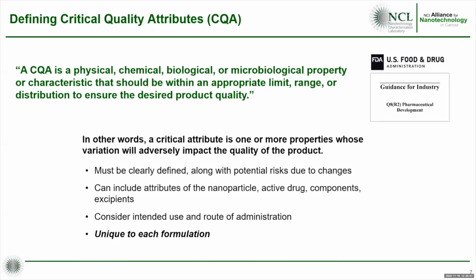So what does that mean? These must be clearly defined along with all potential risks due to changes. This can be anything from nanoparticle attributes. It can be the drug components, excipients. You have to consider the intended use and route of administration. And what makes this challenging is that it's actually unique to every formulation.